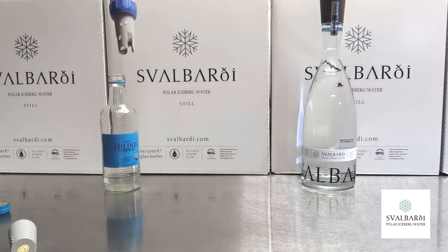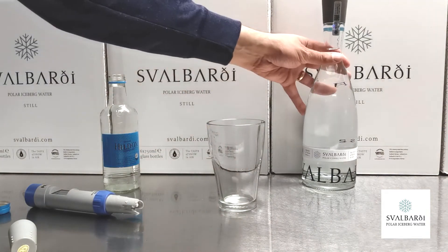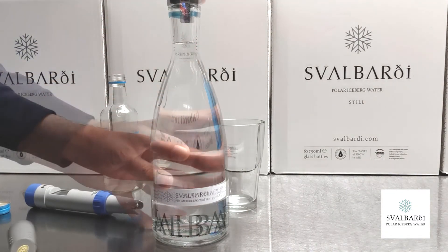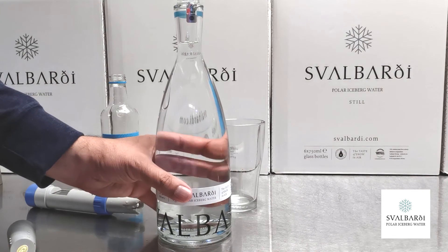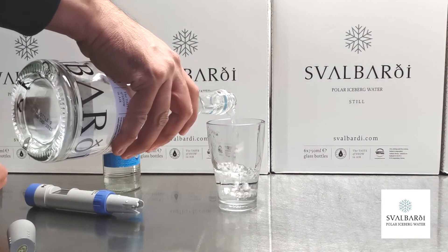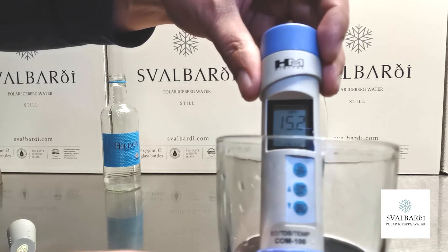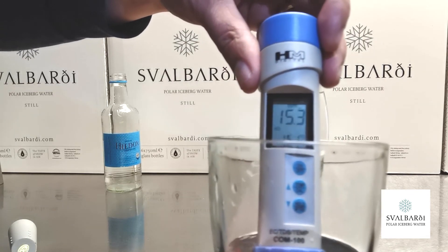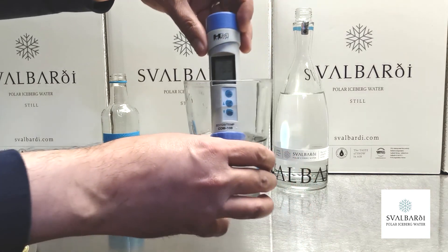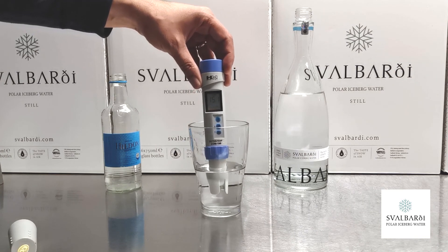We will next try our own Svalbardi polar iceberg water. Hilden is a mineral water, while Svalbardi is an iceberg water, which means it did not have a chance to pick up minerals when it fell as snow and was compacted into ice in a glacier and then became an iceberg. So the TDS level is very, very low — about 15 milligrams per liter versus about 266 on the Hilden. Iceberg water will vary a little bit because each iceberg is slightly different, so sometimes we have single digits, sometimes numbers like this.